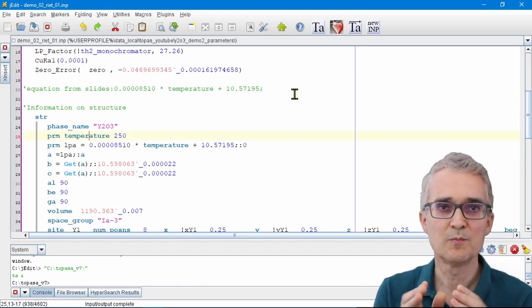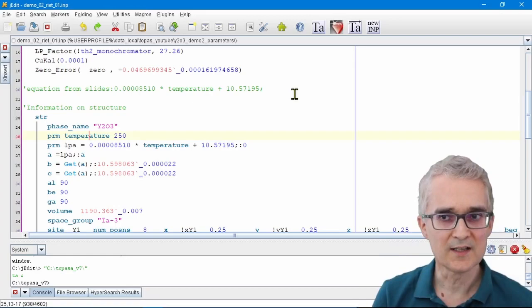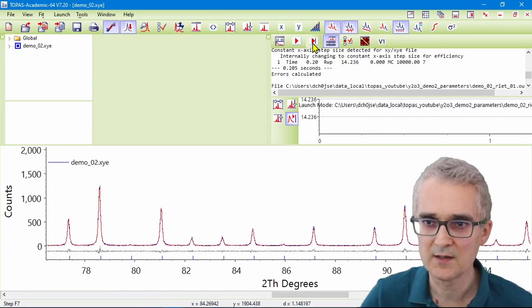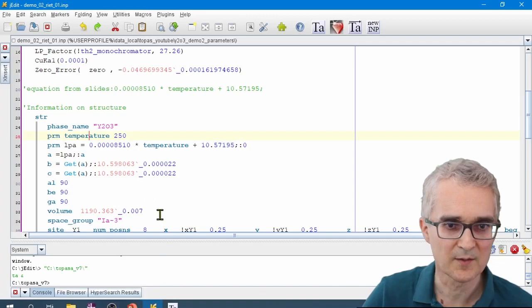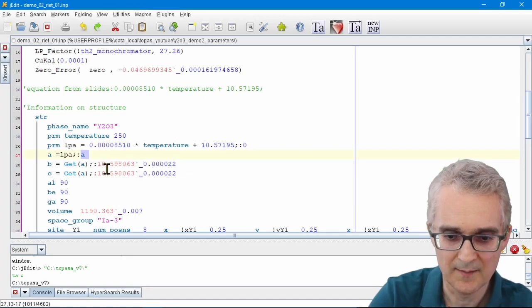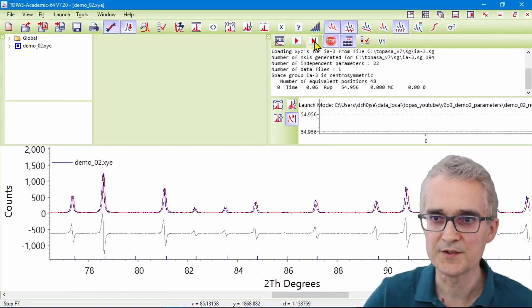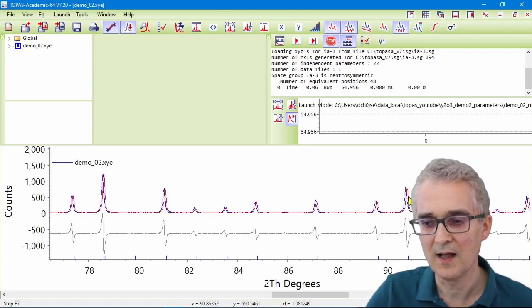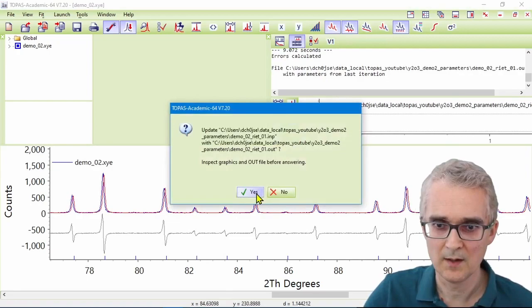So if we get this right, if the temperature, the data is actually 300 Kelvin data. So if the temperature is too low, we should be predicting the cell parameter is too small. So the peaks should all be shifted to a slightly high 2 theta value. If I go back to TOPAS and I do a single least squares iteration, it's telling me I've got a mistake. Let me just go back to my input file. And what did I get wrong? I shouldn't have put the word a there. I should have put zero. Let me go back to TOPAS. A single step. And can you see that my calculated peaks have shifted to a slightly higher angle than they should be, meaning that the cell parameter is too small. So let me stop that.